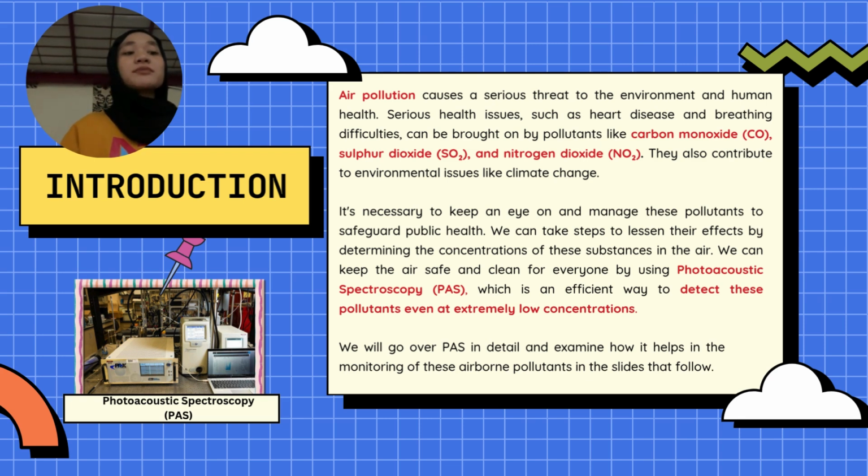One of the key highlights of PAS is its small size, making it more portable and also affordable compared to FTIR and UV-VIS. Alright, so we will look more at PAS in the next slide, and we will compare other methods too, and the potential improvements that can be made to enhance its functionality.